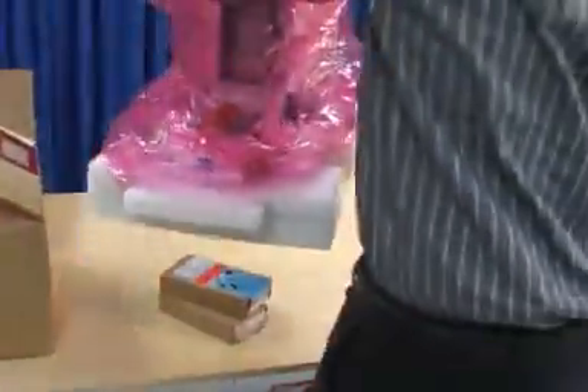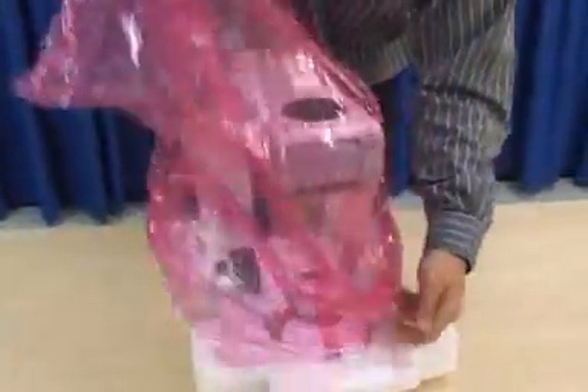Lift the microscope out of the styrofoam box and set it on the table. Remove the plastic bag from around the microscope and all of the dust plugs.